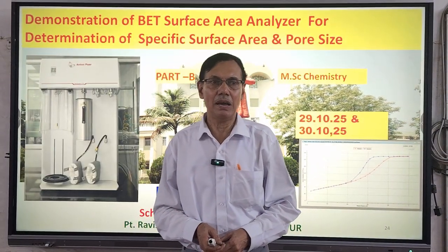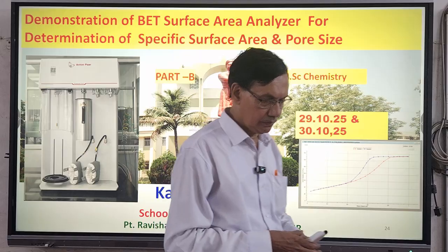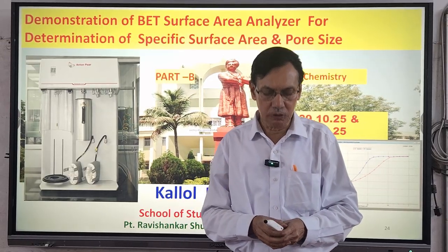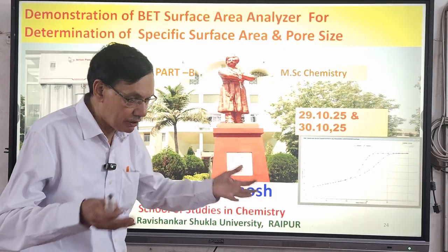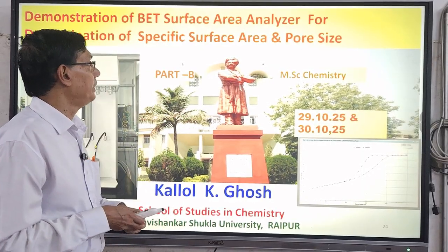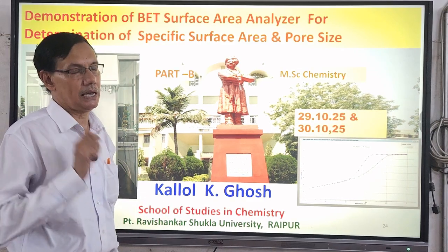So, welcome back to the second session of this video lecture. As in the first lecture, I discussed the fundamental concepts of BET adsorption isotherm. Now in the second part, we'll perform the experiment. I have given the title: hands-on demonstration of BET surface area analyzer for determination of specific surface area and the pore size.